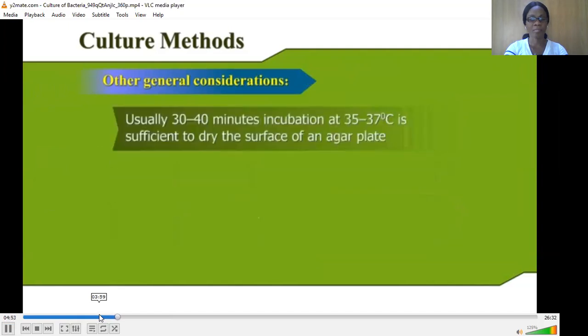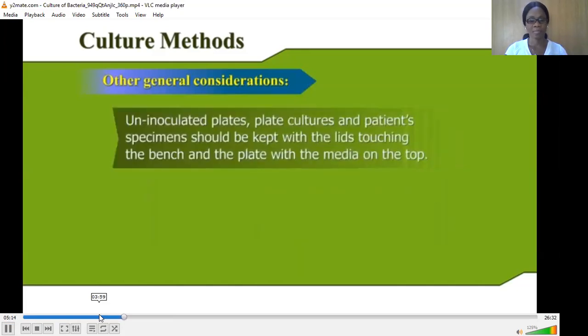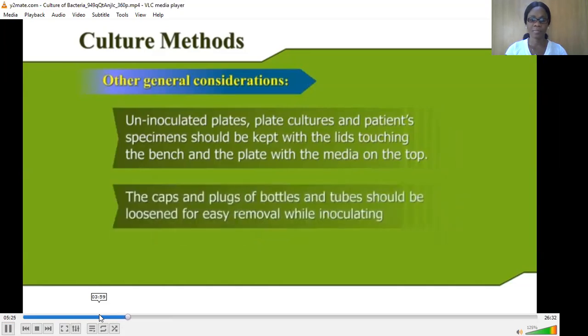Usually 30 to 40 minutes incubation at 35 to 37 degrees centigrade is sufficient to dry the surface of an agar plate. For a right-handed person, the Bunsen burner and the inoculating instruments should be placed on the right, and cultures and media should be placed to the back and left. Uninoculated plates, plate cultures, and patient specimens should be kept with the lids touching the bench and the plate with the media on the top. The caps and plugs of bottles and tubes should be loosened for easy removal while inoculating.